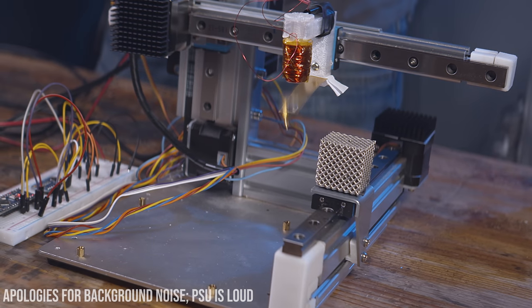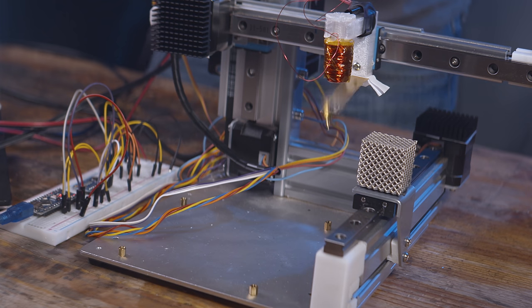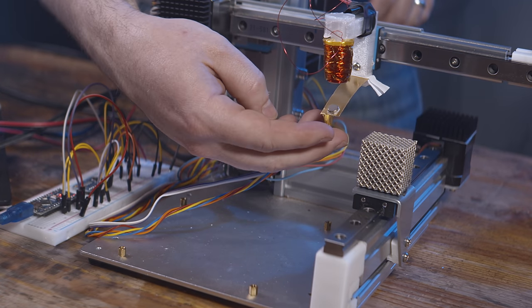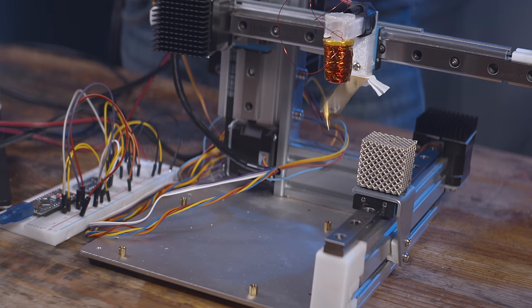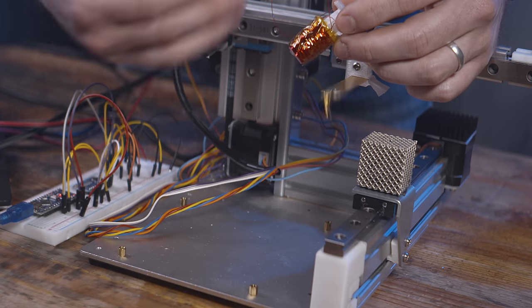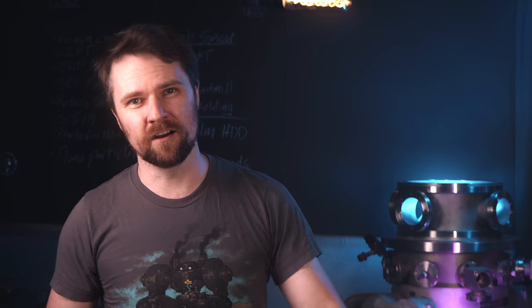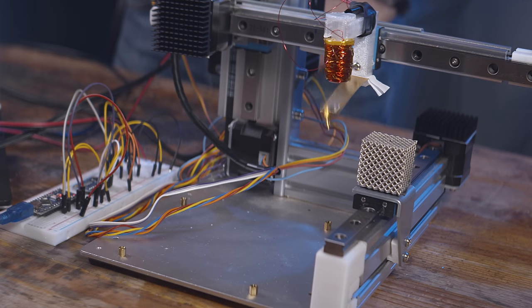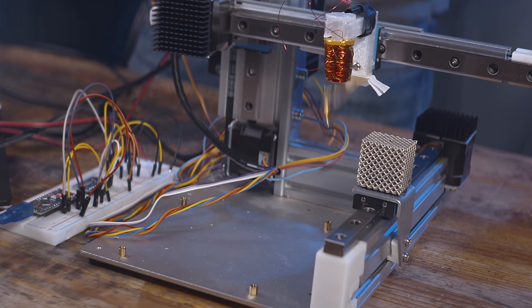This is my DIY macro AFM. It operates essentially the same as what's known as a tapping mode atomic force microscope, although in reality it's much closer to a profilometer than an AFM just because of the forces involved. The cantilever is just a piece of brass shim stock that's been cut to size, with a little tip folded on the end and a magnet glued on top. The cantilever is driven by a voice coil — magnet wire wound around a 3D printed mandrel — excited at near the resonant frequency of the cantilever, which is about 26 hertz.